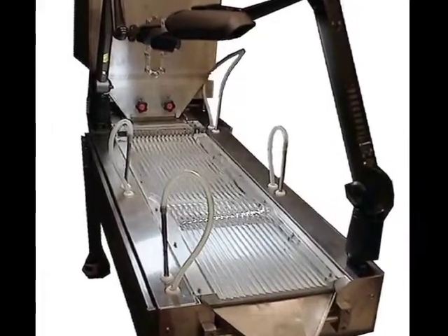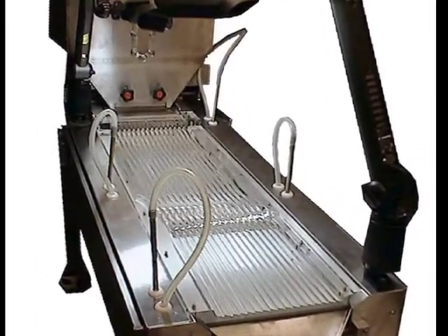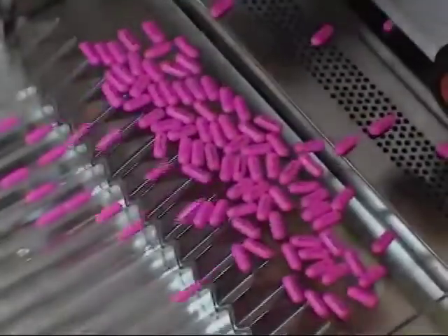This is the Mendel Tablet Inspector, model MTI-1000. This machine is made for visual inspection with two operators for batches of tablets of various shapes. Here are caplets in motion on the acrylic table running through inspection.